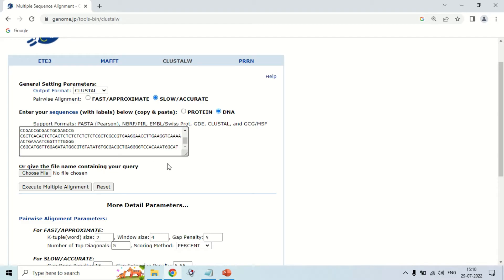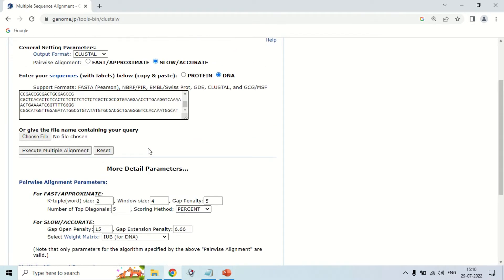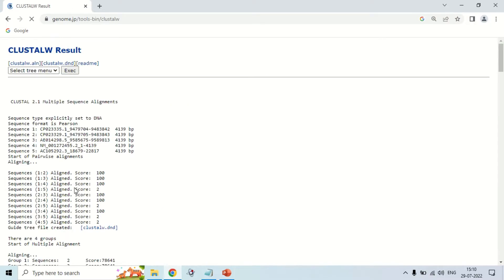Now there is a simple button: Execute Multiple Alignment. Just click it and the multiple alignment will run. There are some more options like more detailed parameters, which are for research purposes that I will cover later. For this basic demo, I am just going to perform the multiple sequence alignment by clicking Execute Multiple Alignment. It will take some time to align the sequences, and after that the results will be shown.